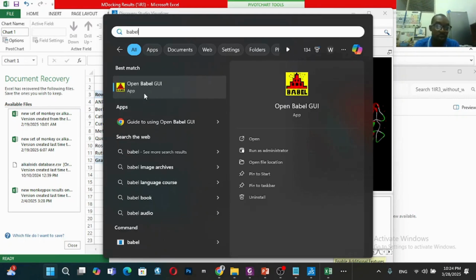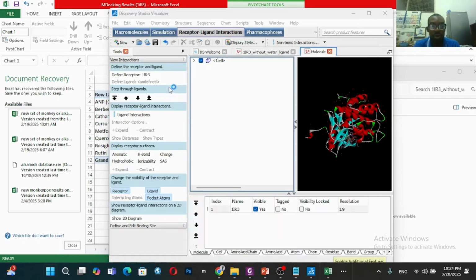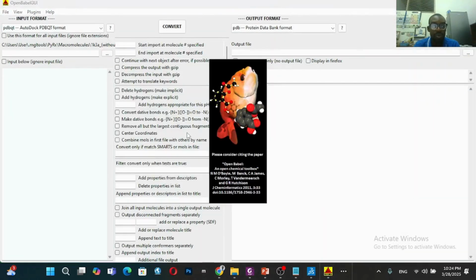Now, you must have installed Babel. I will give you a link to all of these software so you can install them, and then you practice while we are also doing it here. So open Babel. Good.